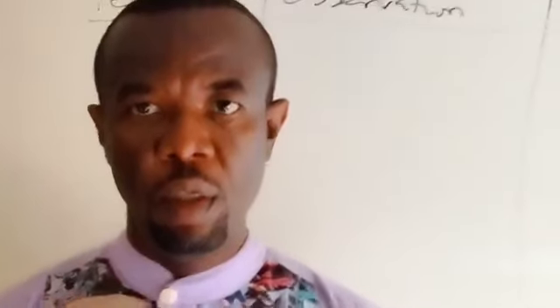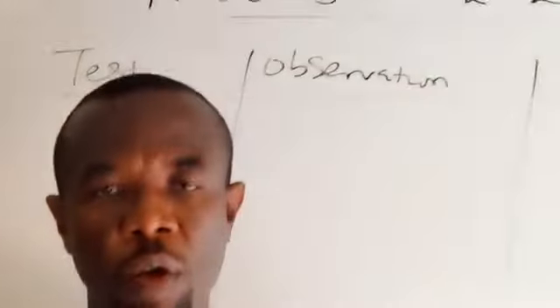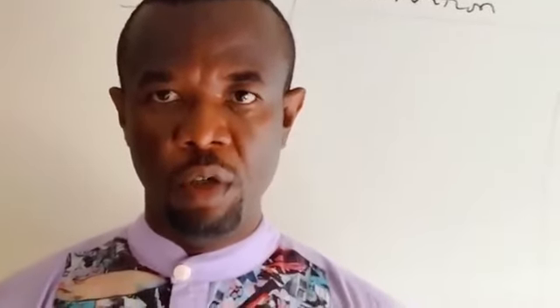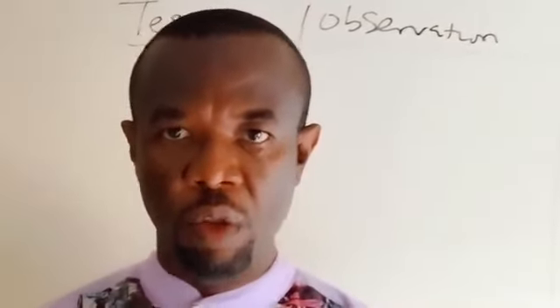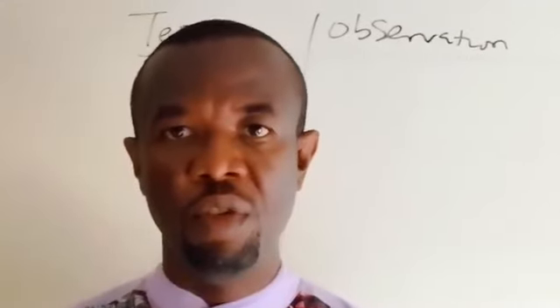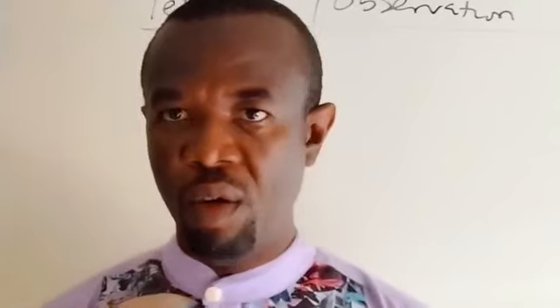Today we are presenting NECO 2024 solution to the specimen, and we are looking at the test for anion and cation, which is known as qualitative analysis. Already we have done the video on endpoint determination, that is quantitative analysis or titration, in this channel, so you can stream our videos to see that. But at this point in time, we're going to look at the test for anion and cation.